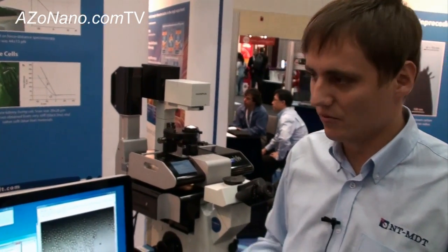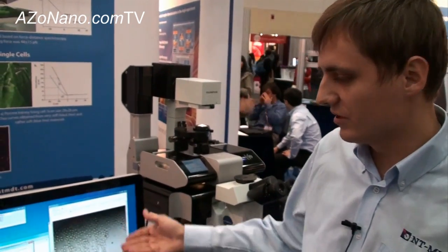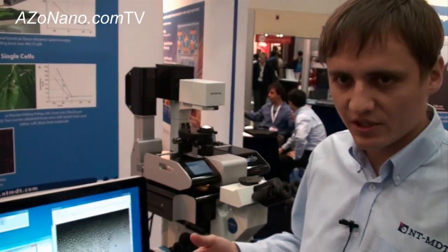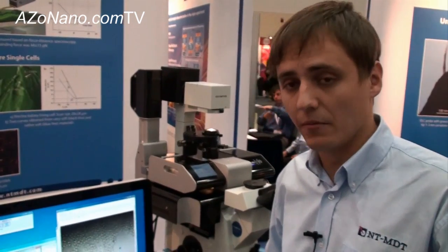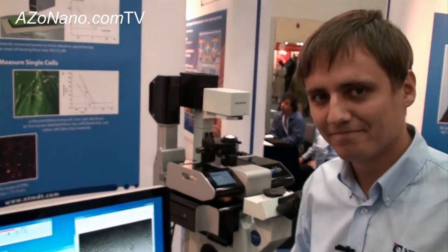What sort of resolution does it have? AFM resolution is down to atomic. In optics, you can use high immersion objectives, so the optical resolution is also at the highest level. Okay, Stanislav, thanks very much for telling us about the new Integra Life system.